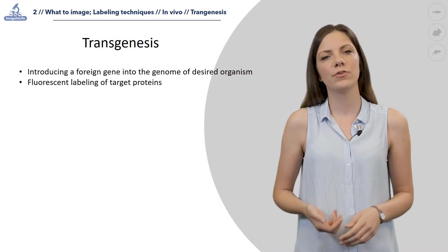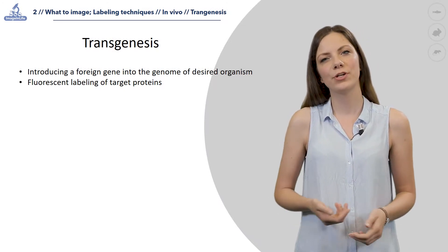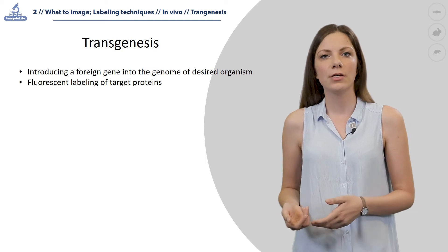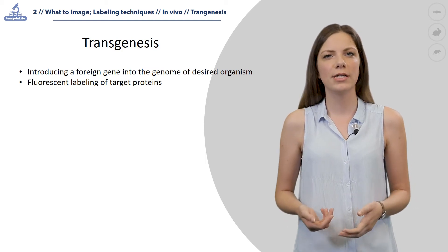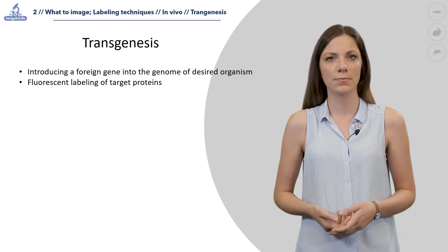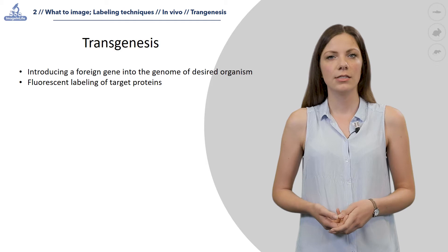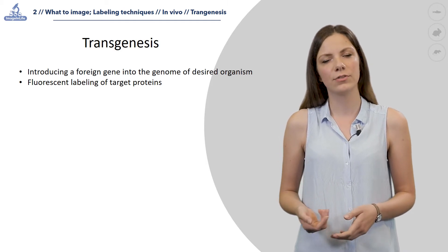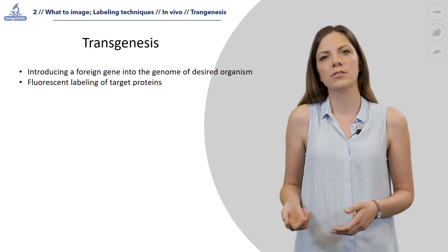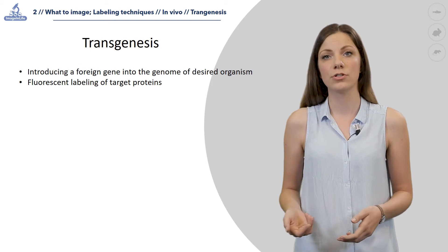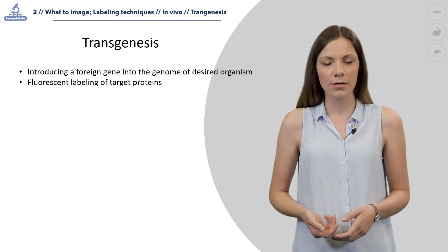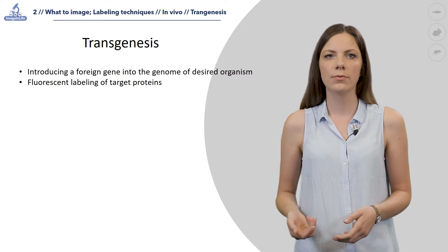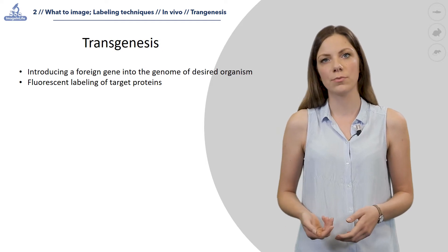Transgenesis is the process of introducing a foreign gene into the genome of a desired organism in order to obtain a desired property of that organism. This technique is widely used for fluorescent labeling of target proteins in model organisms such as zebrafish. In this way, fluorescently labeled molecules can be easily monitored by fluorescent microscopy.